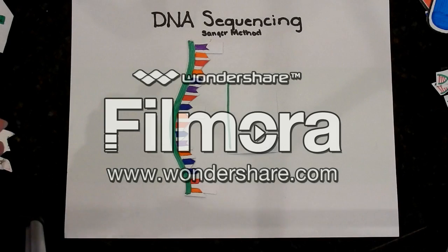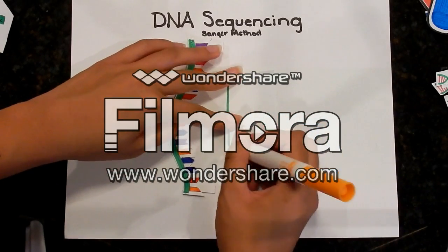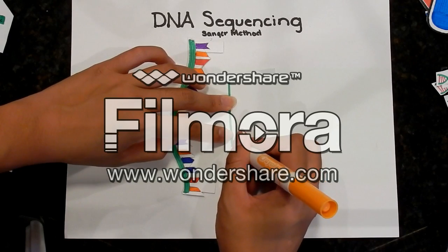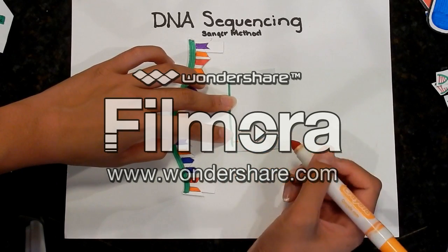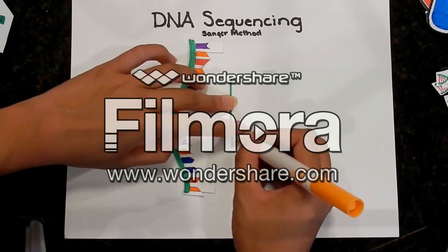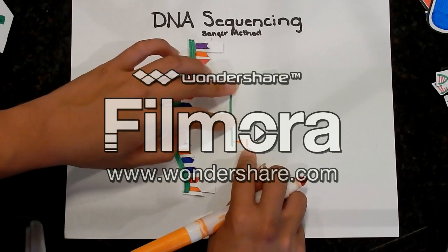And if we were using the adenine dideoxynucleotide, and a dideoxynucleotide was added here, because that's where one of the adenine molecules would be, there would only be one strand of DNA that long.